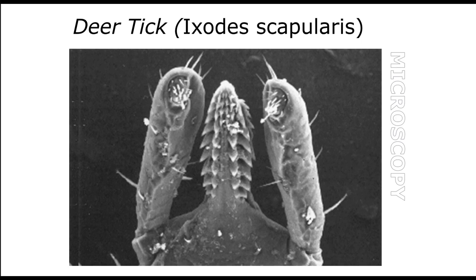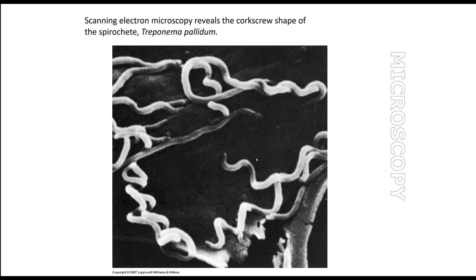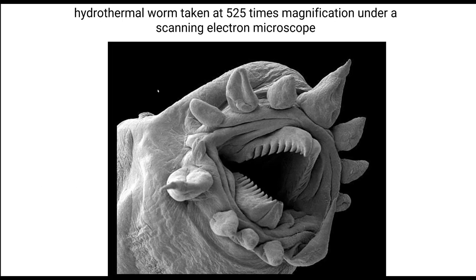Here is a fly head, a deer tick (Ixodes type that carries Lyme disease), and you can see the proboscis with small scales that allow it to go in but not come out — like a fishing hook. That is why tweezers should be used to clamp it where it is sticking in and then remove it, rather than using heat. Here is Treponema pallidum prepared by pushing it through a filter. It is a corkscrew-type organism that causes syphilis. The level of detail visible at the nanoscale is just incredible.